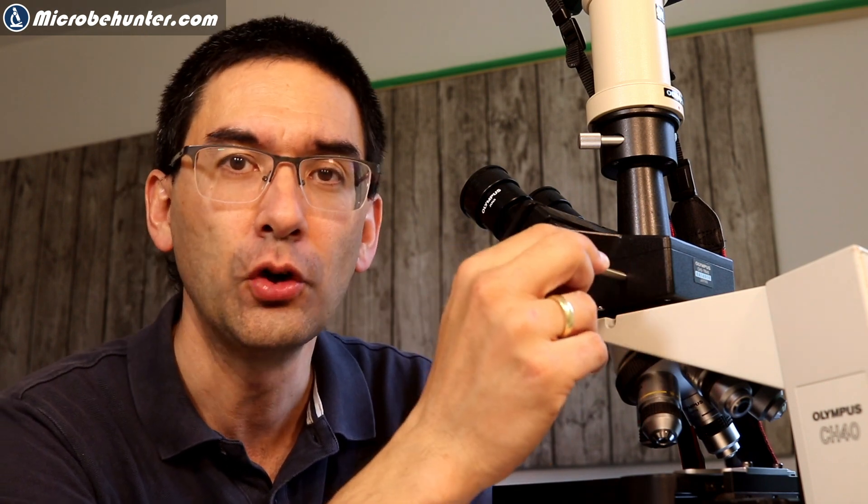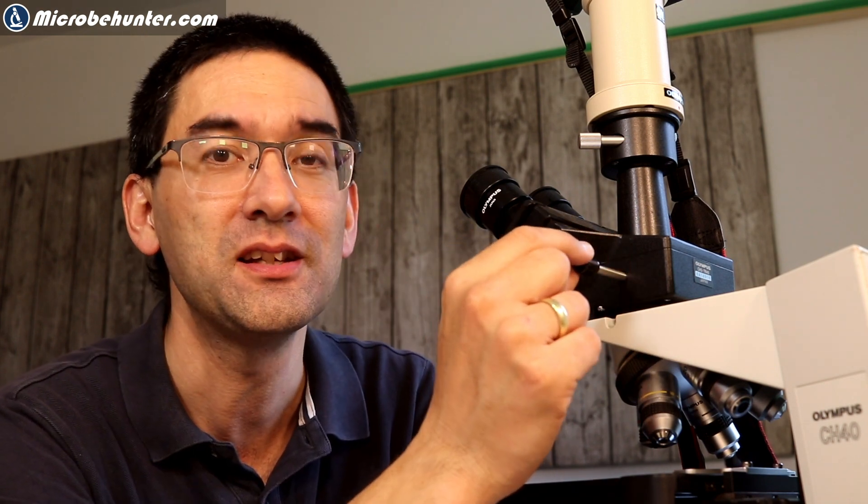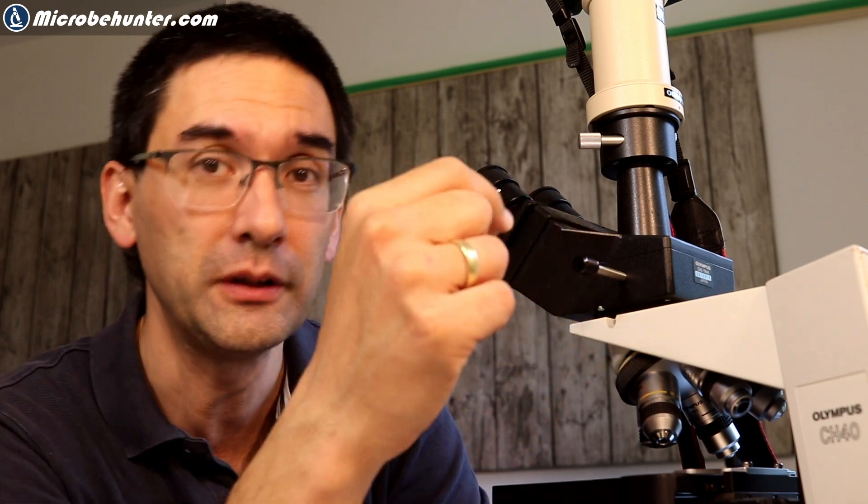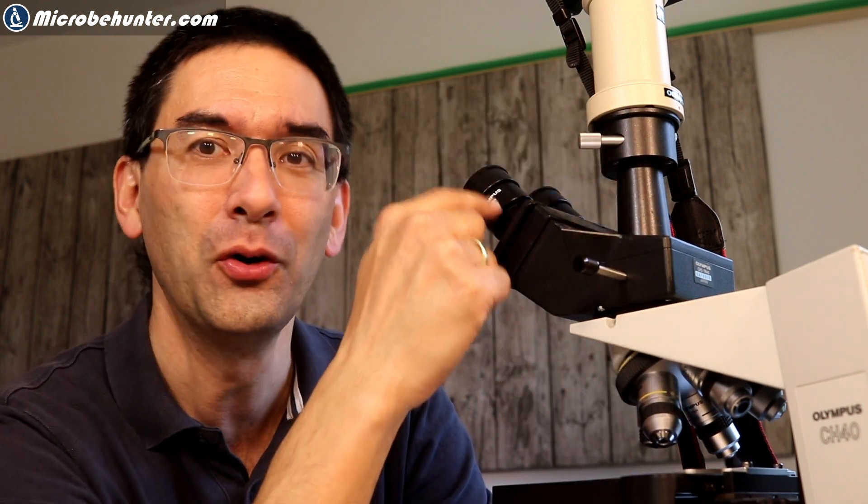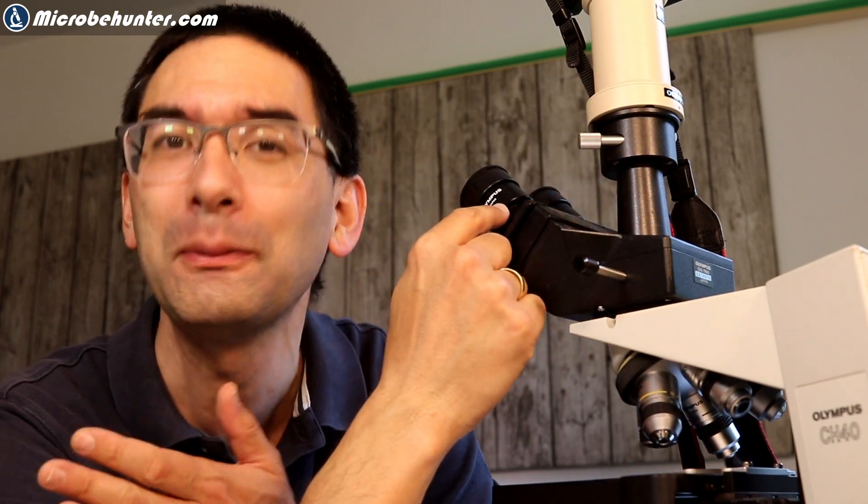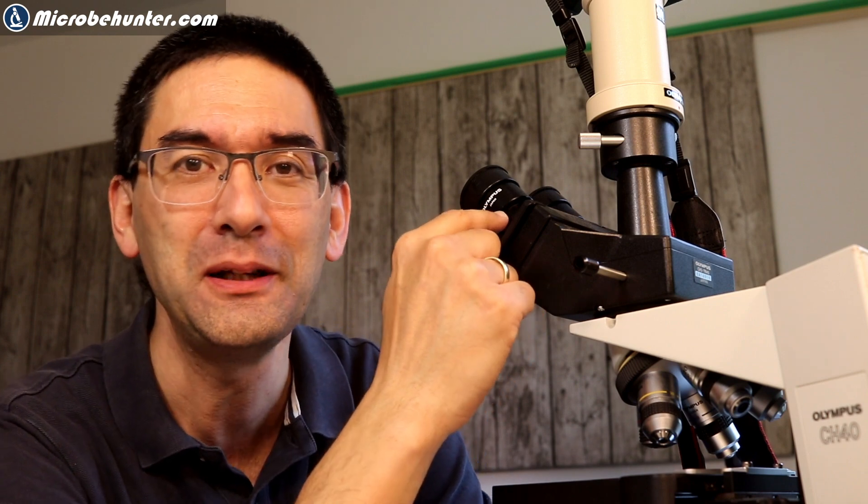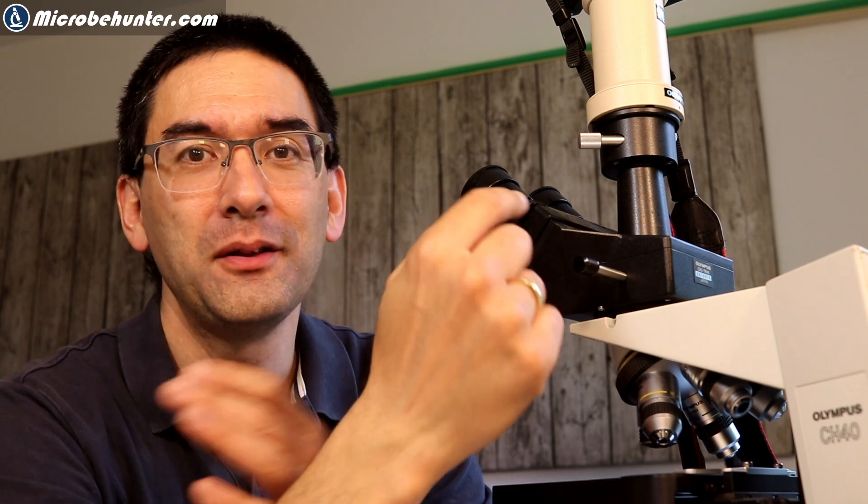Now very high-end microscopes, sometimes what they even have is a third setting where you can even pull it out even further or push it in even further. We then essentially have all of the light, 100% of the light, going now to the camera and zero to the eyepieces and the eyepieces are completely black. So even that is a possibility.